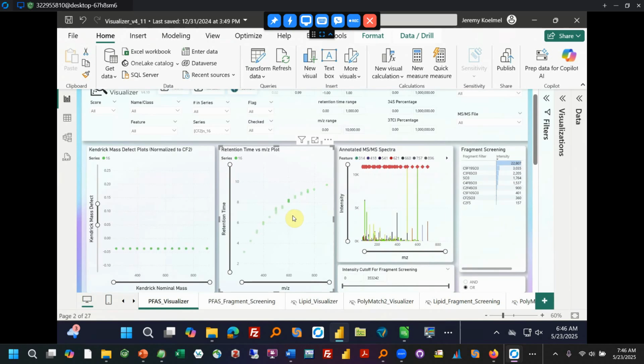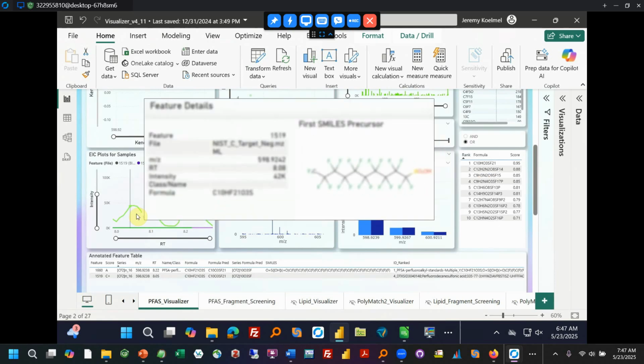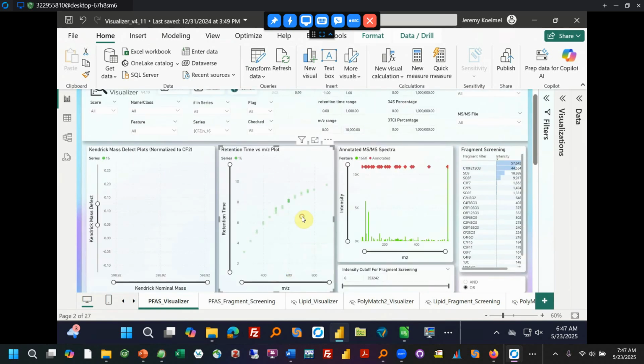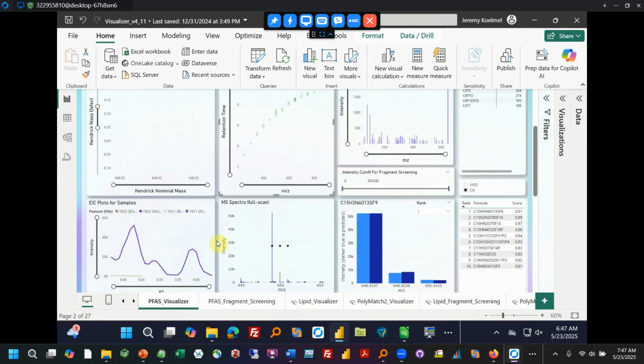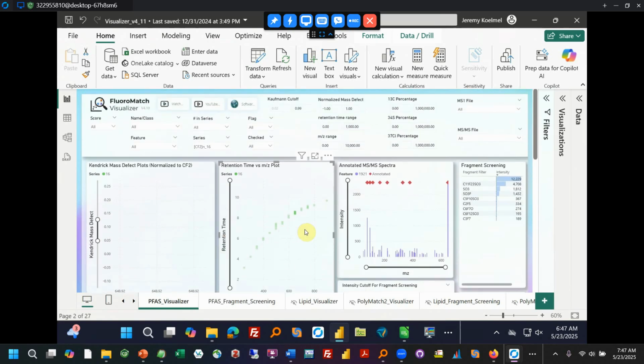Same thing. Let's go series to series. Okay. Again, 8.22, 8.05. Okay. Again, there could have been more isomers here. Note that when you do have more samples, in this case we only uploaded a single sample, and so it only has a single chance to find all of those peaks, that it will have more chance of finding all those isomers.